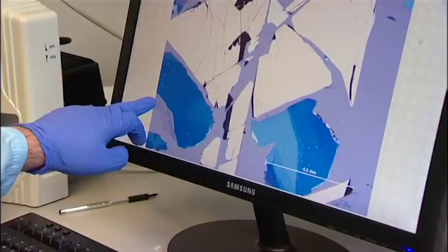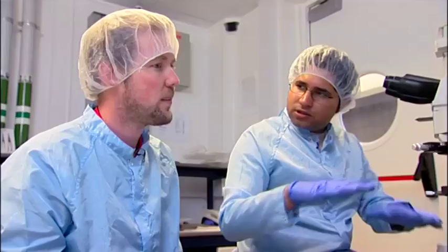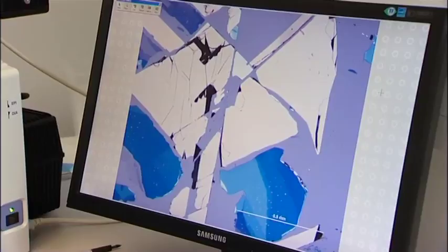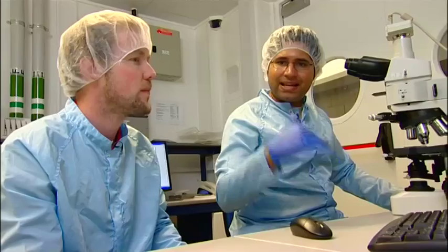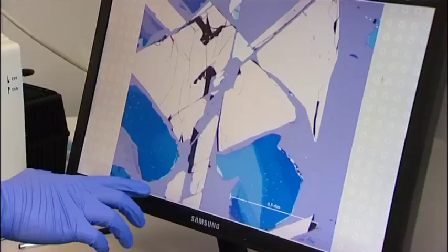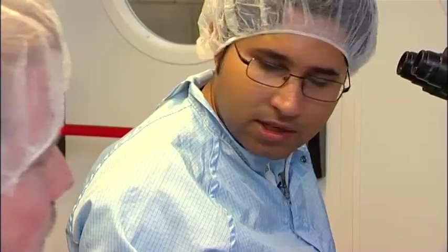So what's causing these speckly coloured bits here on the blue? When the flakes get fairly thin, there's always some air or solvent trapped underneath the flakes, and it causes bubbles because it's like a very thin fabric. Usually we do end up having a few of those on the sample. As you start going to thinner and thinner layers, you see it starts turning different shades of blue. What we need to find are the very, very thin sheets. When it becomes less than ten layers, you go from blue to shades of purple. The yellowish purple you see in the background is the substrate, and the dark purple bits are all less than ten layers. The very light purple bits are the thinnest section. With a bit of practice, you can just look at the screen and say — that's a single layer, that's a double layer.